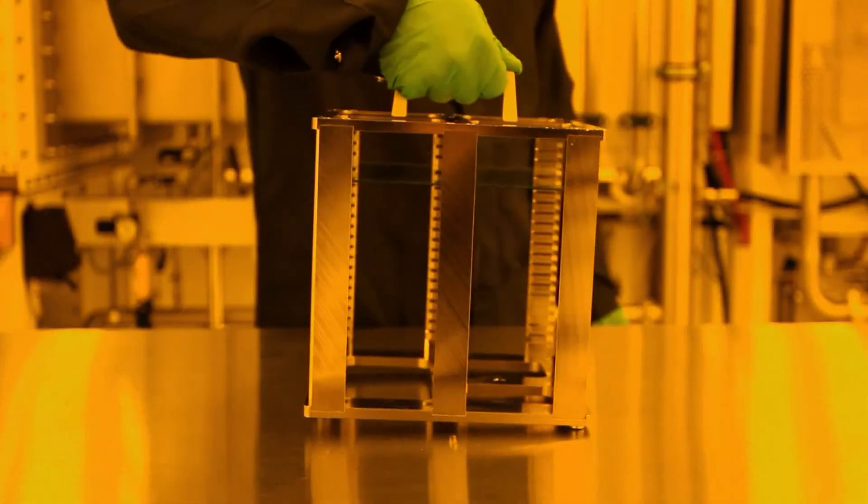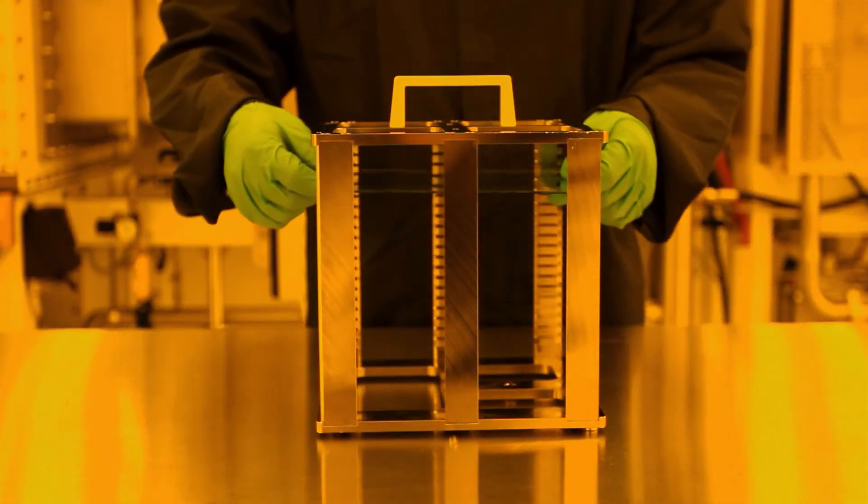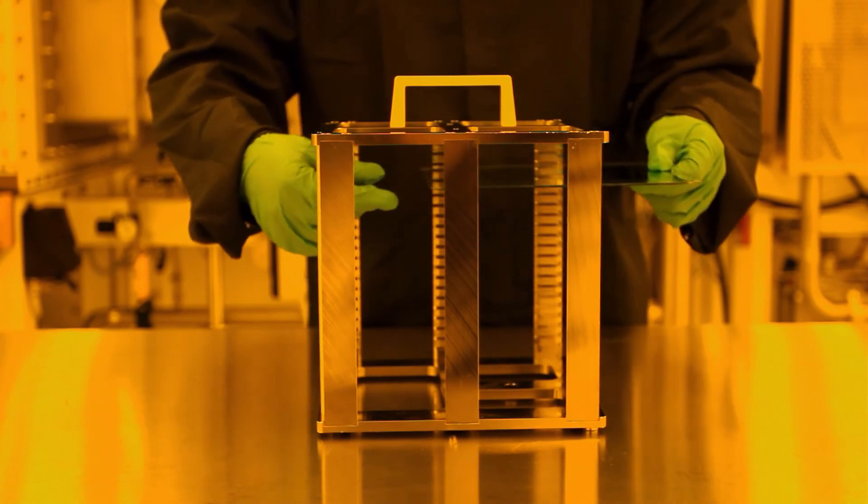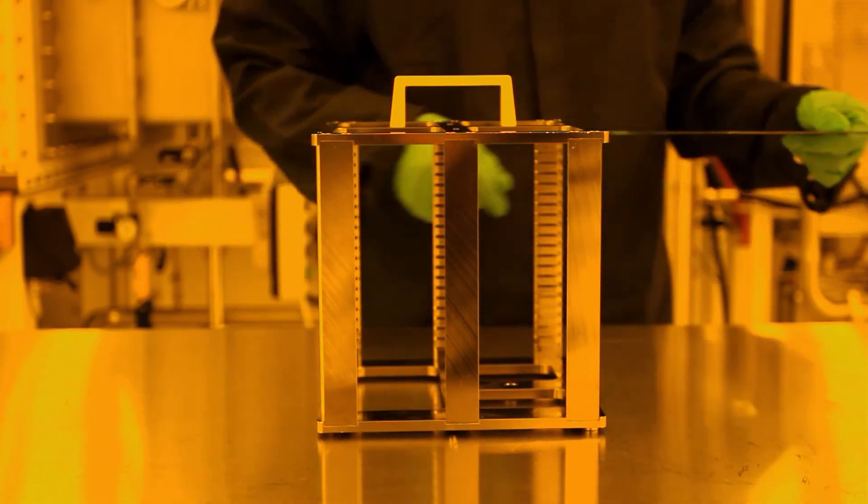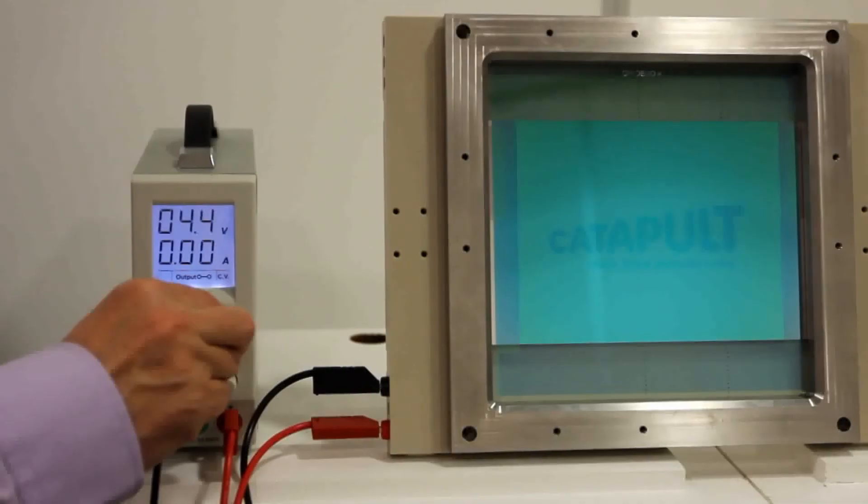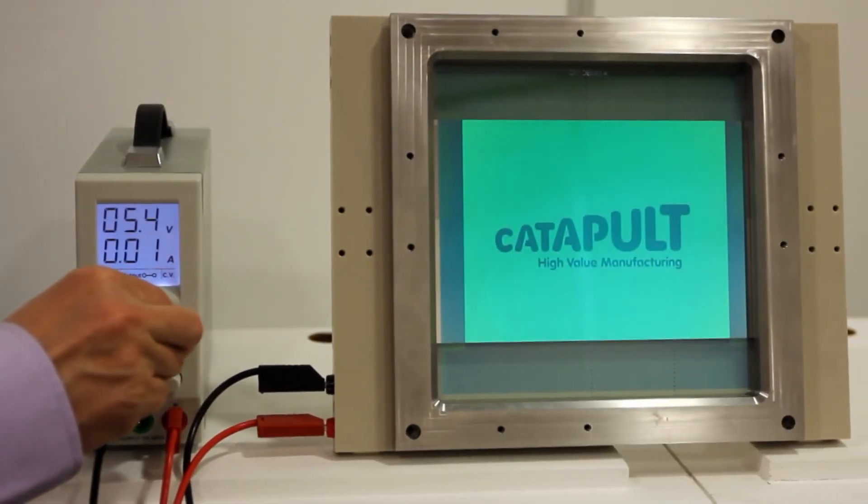With illuminated areas typically in the region of 250 cm2, the line is equipped to produce some of the largest solution-processed OLED lighting demonstrators reported in this rapidly growing industry.